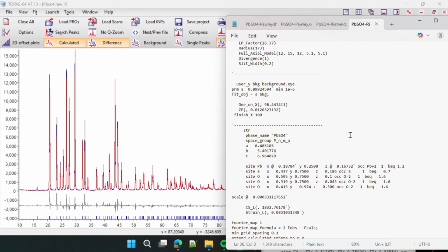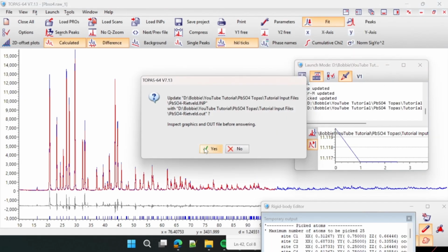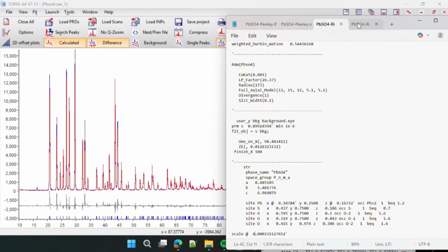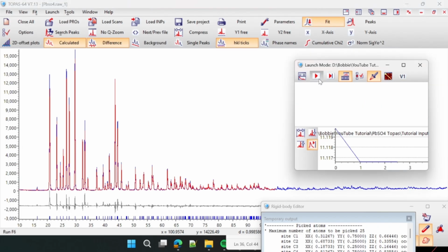187. Yeah, that's fine. We'll run it again, and then we'll accept it. Now, please. And now we will look at these filters. You know what, we might keep these two on. Save that, and then run the refinement.